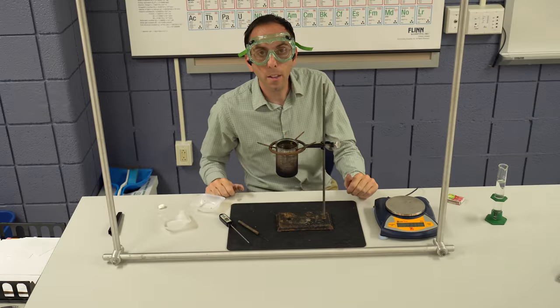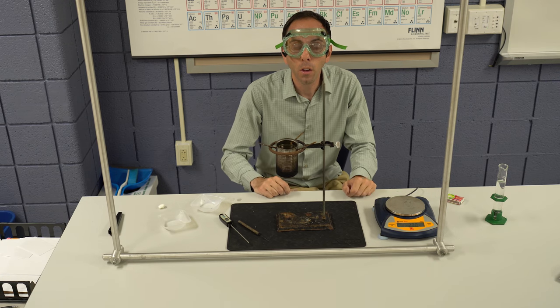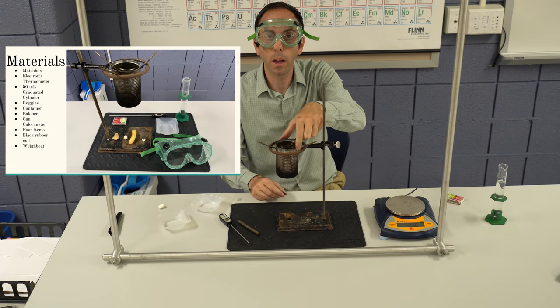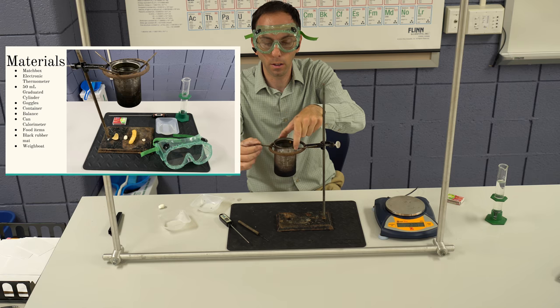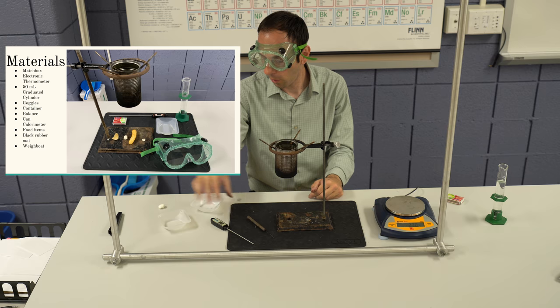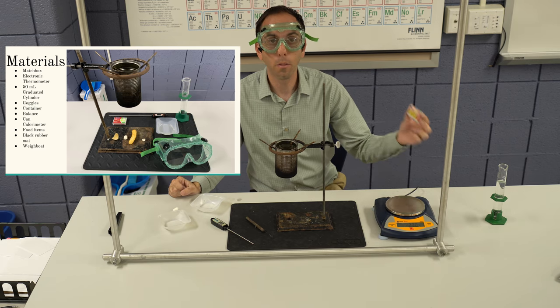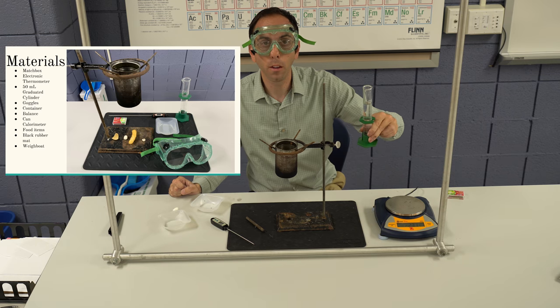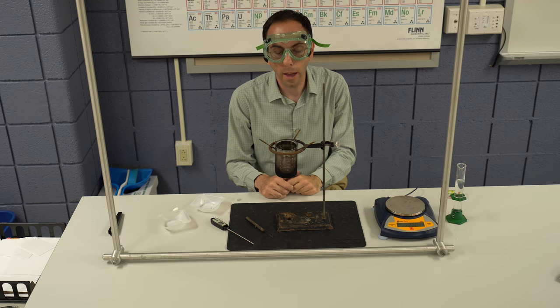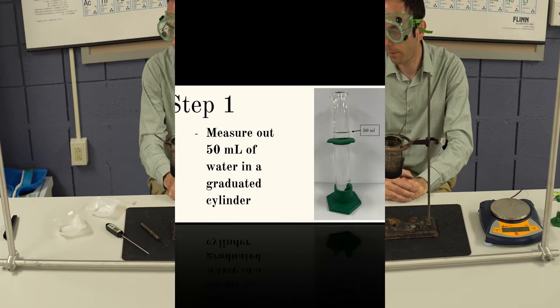Okay, so here I'm going to go over the basics of the calculating calories lab for food. What we're looking at here is our setup. We have a ring stand with a ring on it. We have an aluminum can with some nails in it to help support it. In addition, we have a thermometer, a wooden skewer, some weigh boats, a food item to be testing, a balance, some matches, and a graduated cylinder so we can precisely measure 50 milliliters of water. We may also want to add a timer to this setup. So I'm going to go through the basic instructions here.